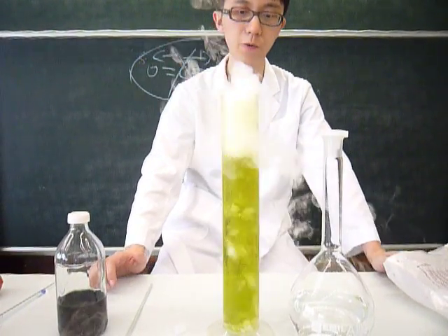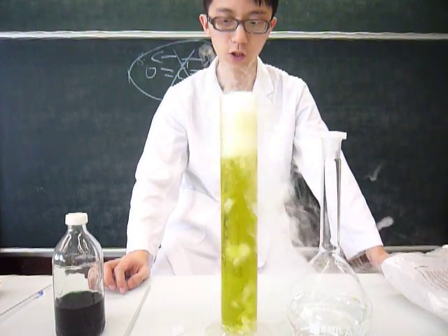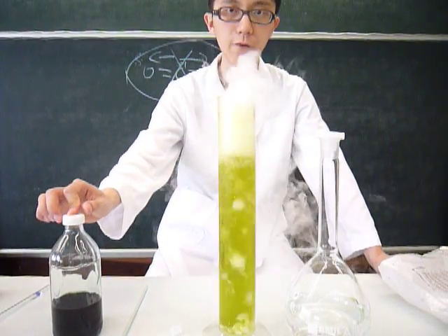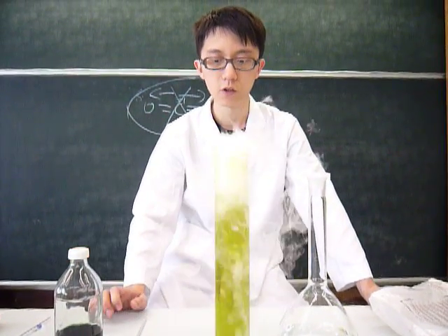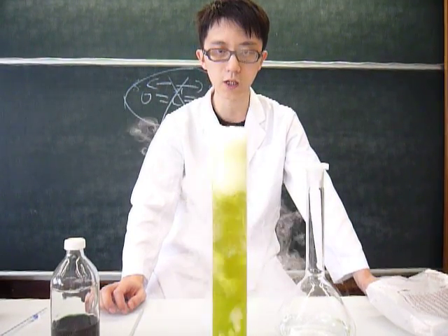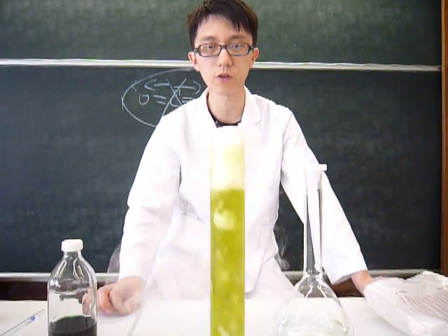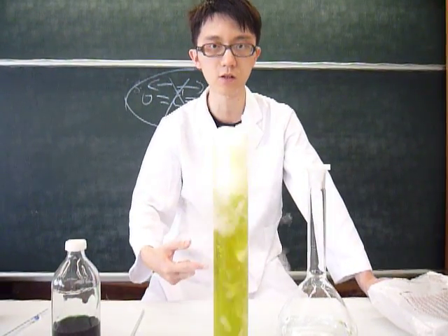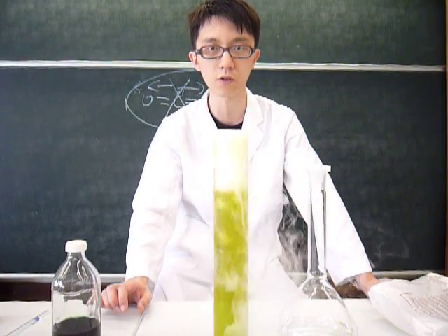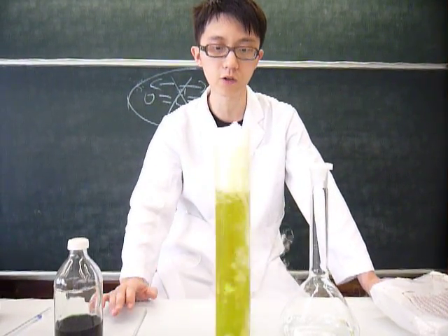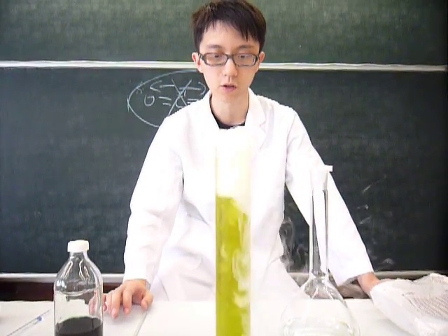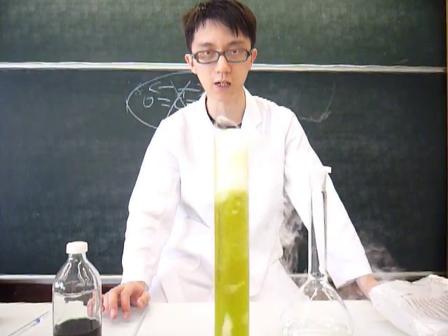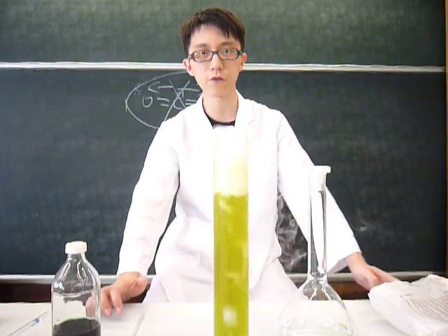In this experiment we demonstrate the color change of the pH indicators. We started with sodium hydroxide, which was purple in color. When we put the dry ice in, it sublimed to give out carbon dioxide, which dissolved in water to form carbonic acid, reacting with the sodium hydroxide in a neutralization. After that, it changed to yellow in color because the solution became slightly acidic. That's the end of this experiment.